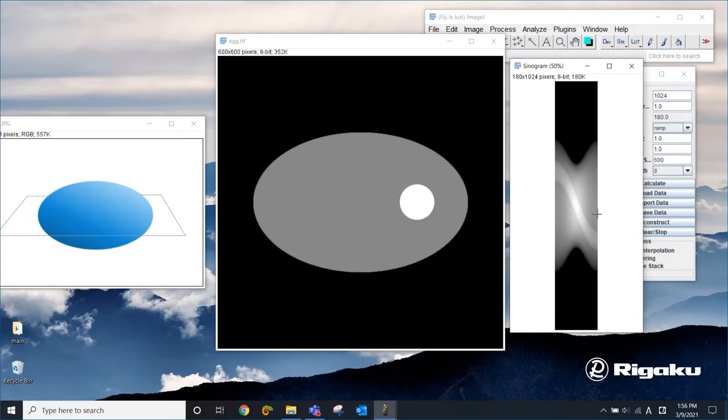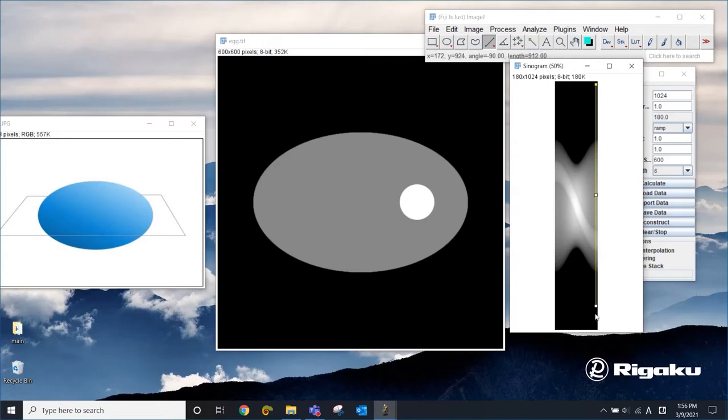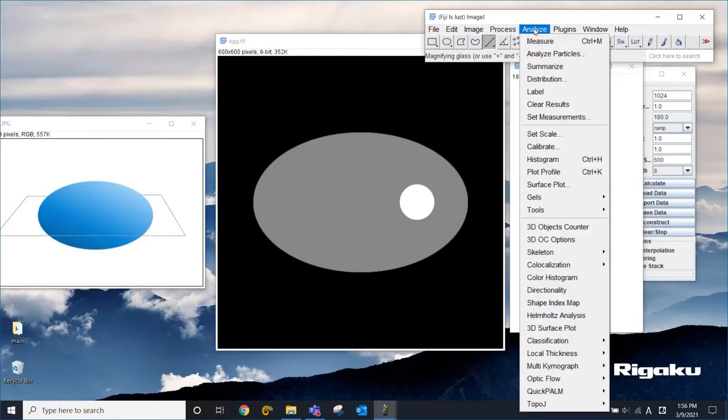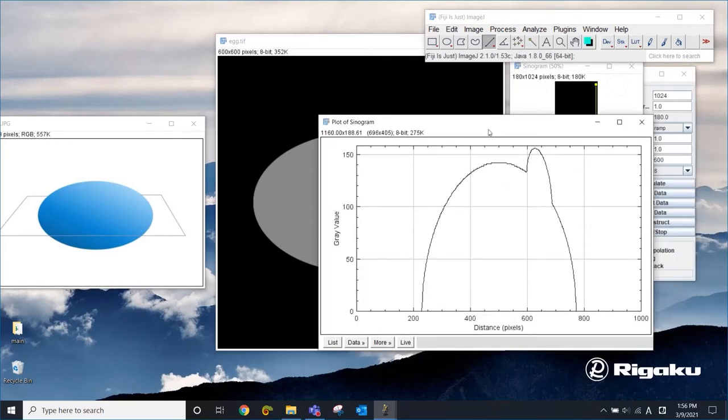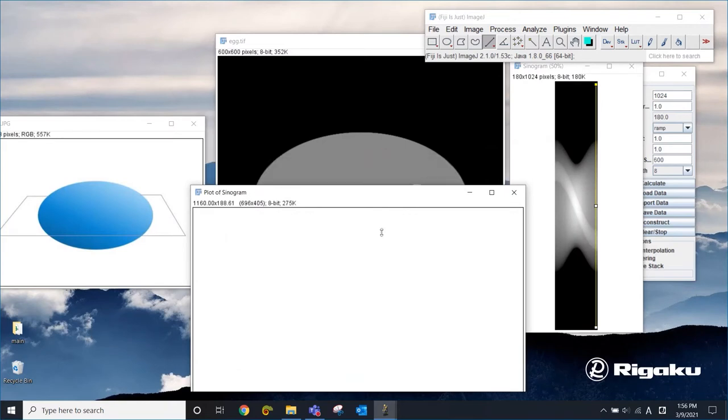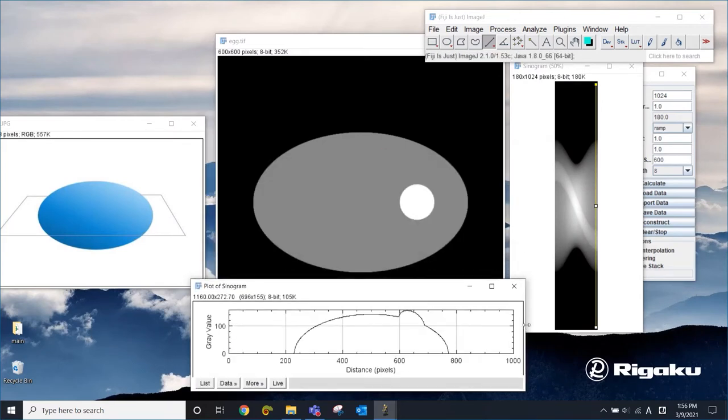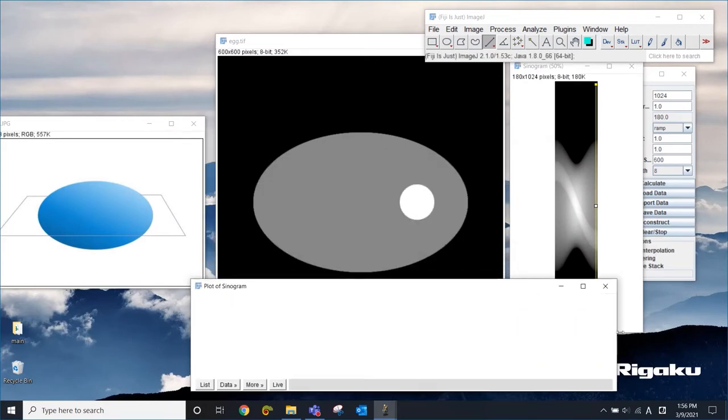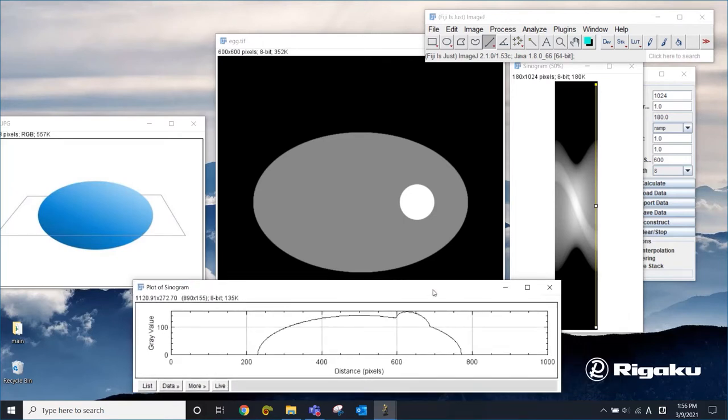Let's think about what we're looking at here. To understand this better, I'm going to draw a line here to extract just one projection. I'm going to analyze and plot profile or you can do control K. So this is just one projection, meaning that this is the projection into one direction.